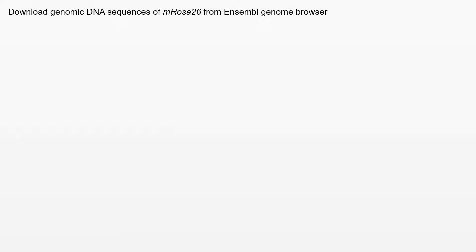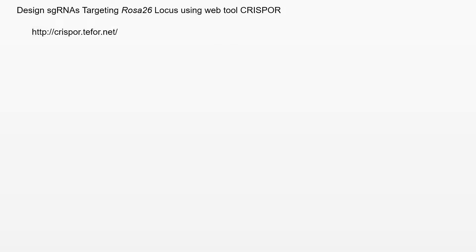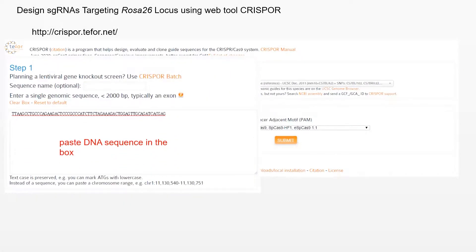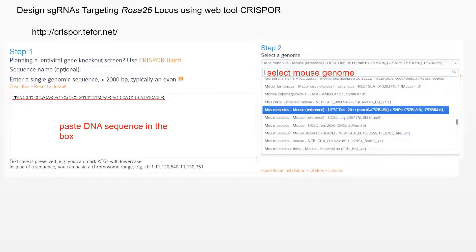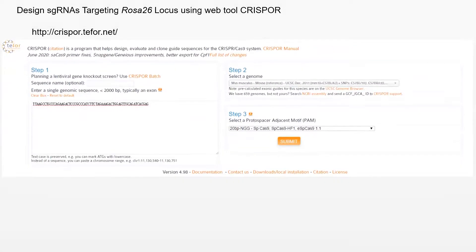First, design sgRNAs for the mouse ROSA26 locus using sequences from Mouse Genome Informatics and the Ensembl Genome Browser. Download the genomic sequence of the mouse ROSA26 gene, then go to the online web tool CRISPOR and paste 100 base pairs of input sequence from the ROSA26 locus. Then select the genome — for example, Mus musculus mouse reference genome 2011 — and select the type of PAM. Use the 20 bp NGG PAM motif recognized by SpCas9.